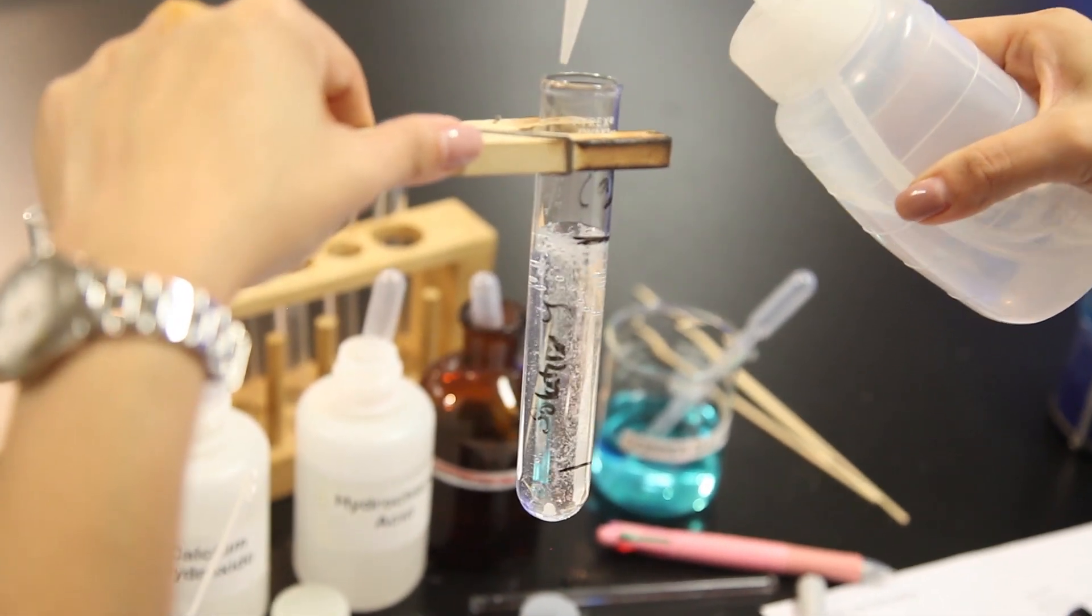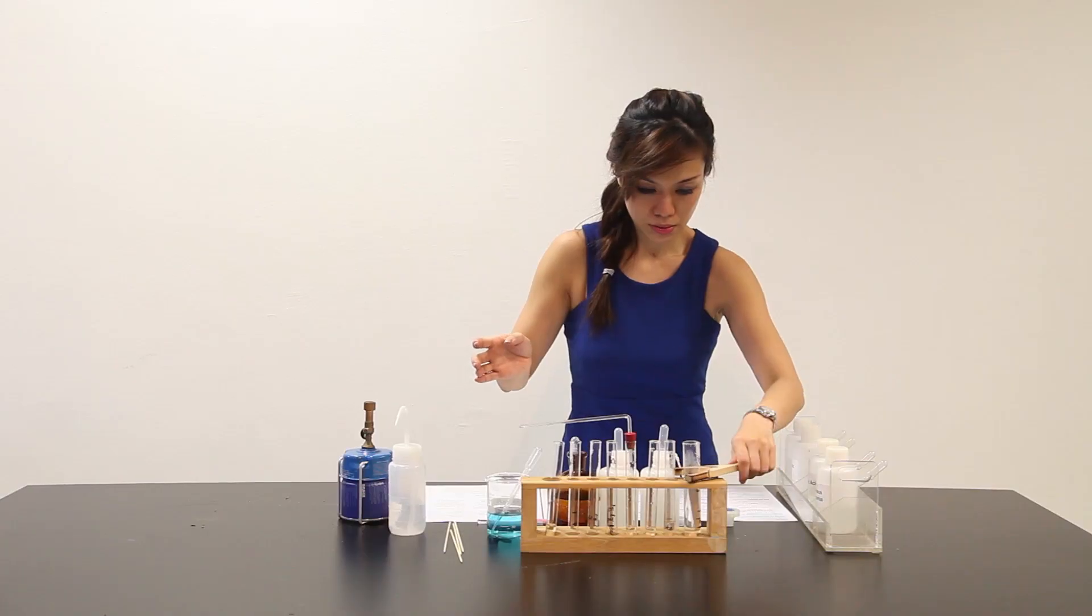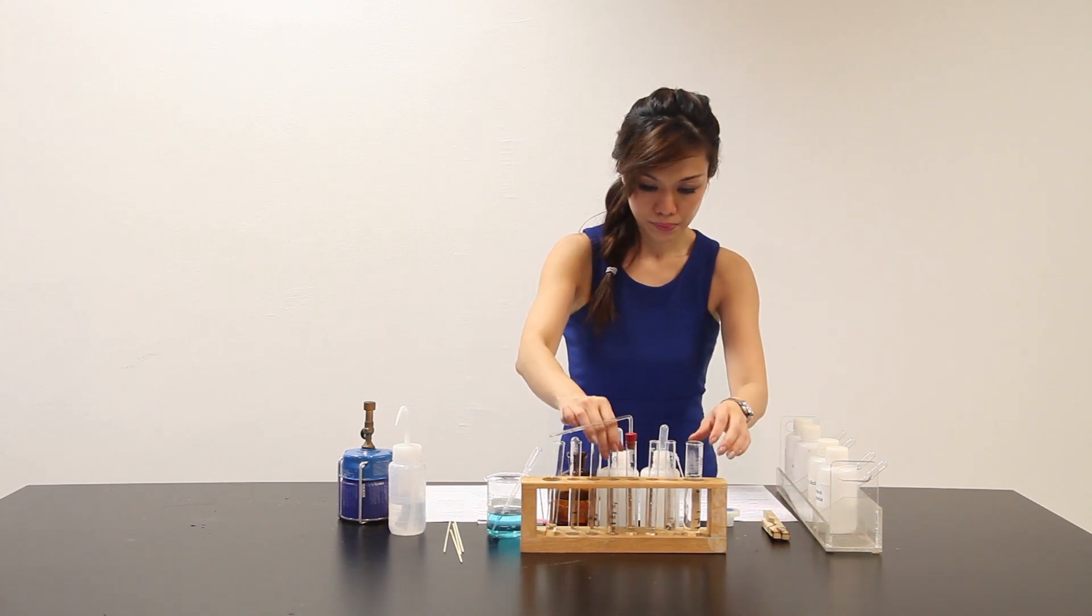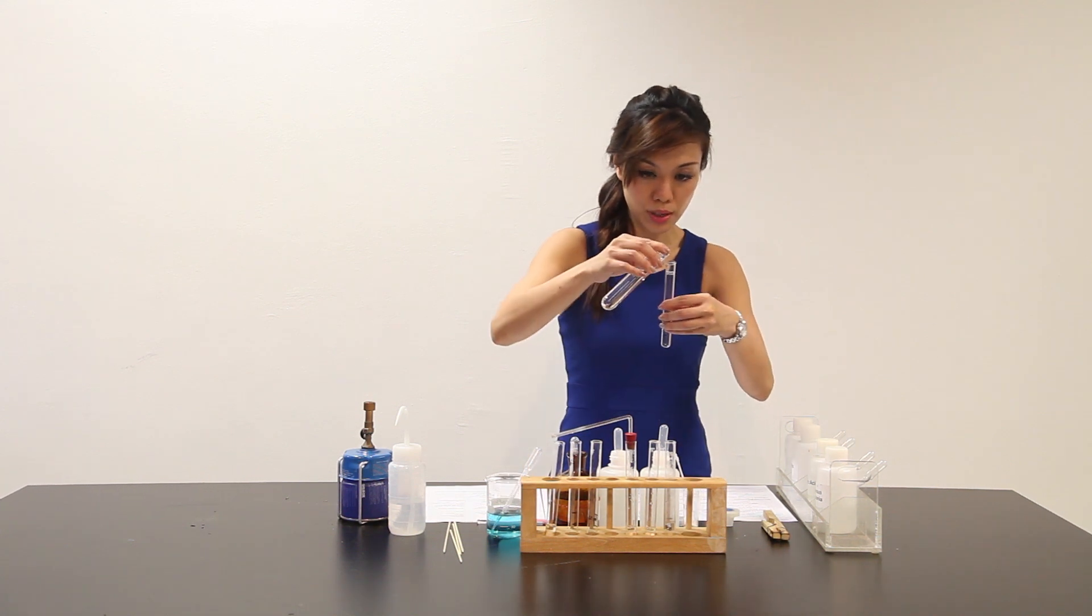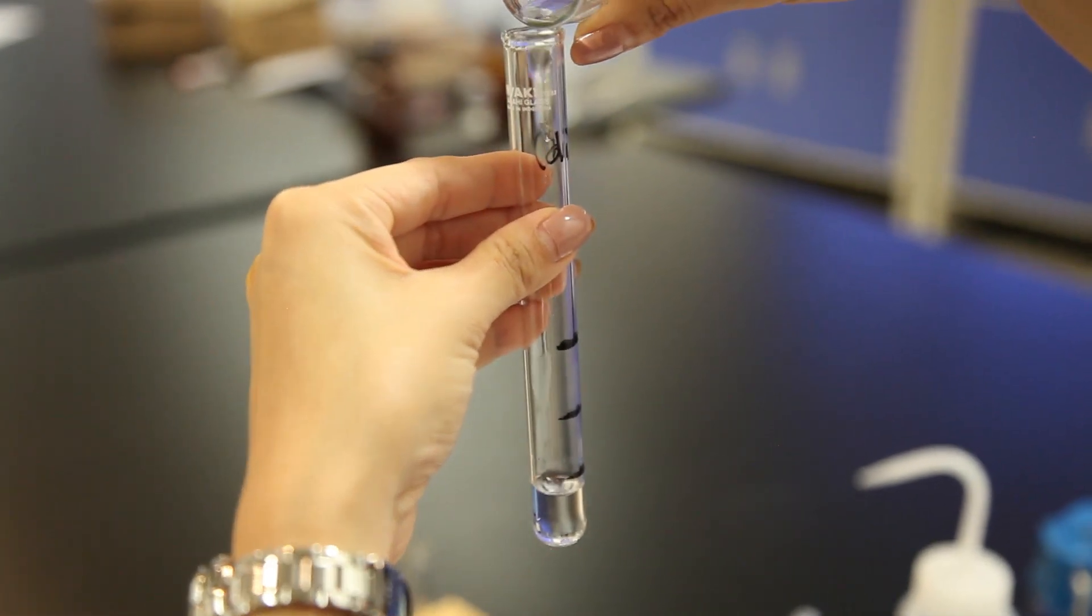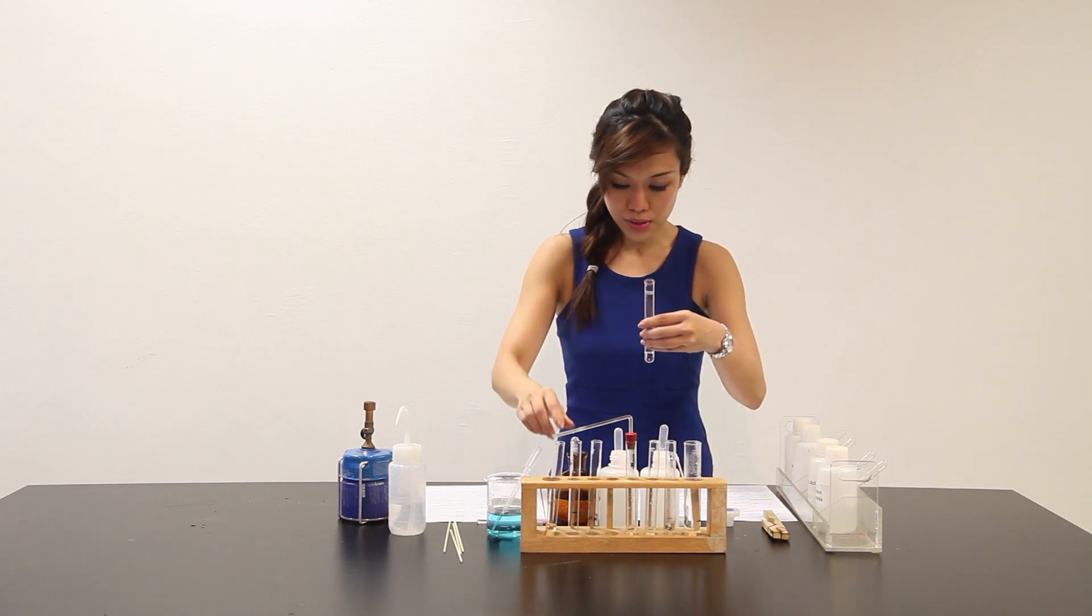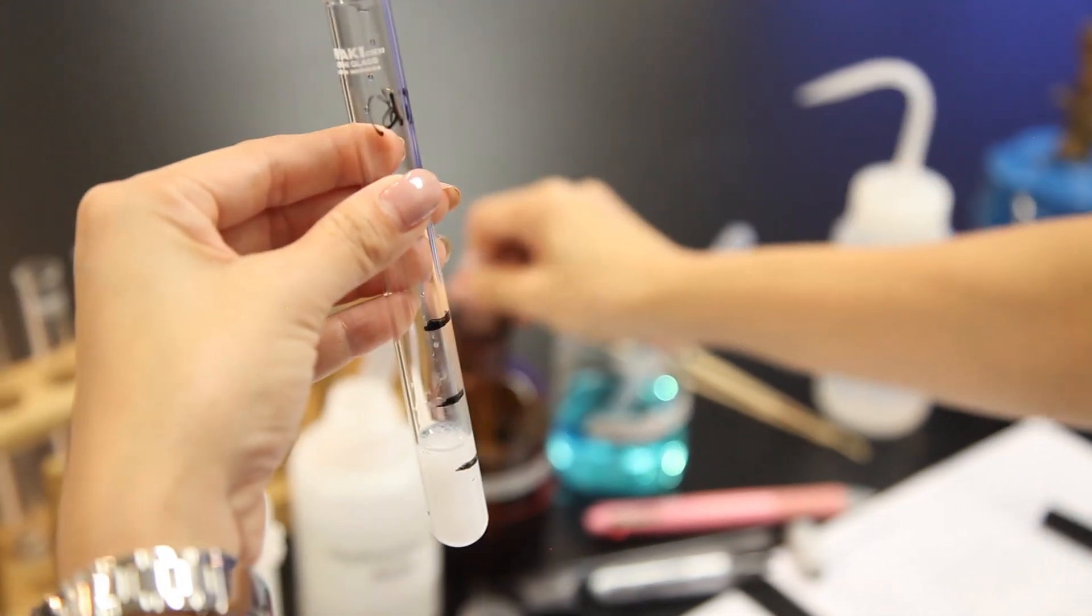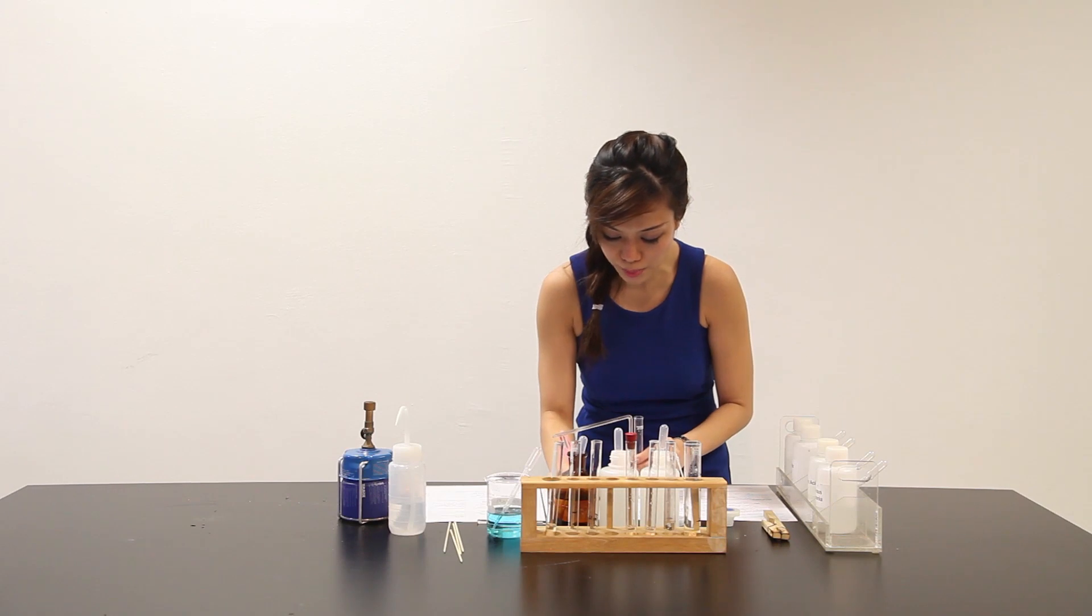Add more of the distilled water until the test tube is about 3 quarter full. I'm supposed to add about 2 cm3 of barium chloride solution. Upon adding 2 cm3 of barium chloride, white PPT is observed.